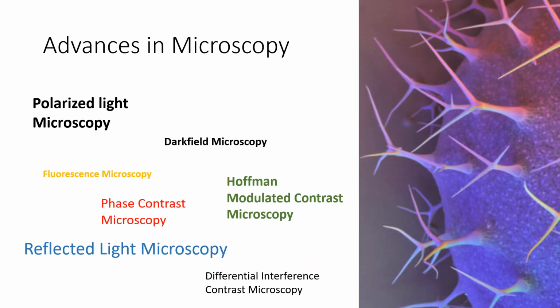Using optical or light microscopy, we can see images which are resolved up to 200 nanometers, or 0.2 micrometers. So up to 0.2 micrometers distance, we can use light microscopy. That means we can see crystals clearly under a light microscope. The morphology can be seen, but if we want to gather atomistic details, it is not possible through a light microscope. Then you need to go to more advanced techniques, the electron microscopes.